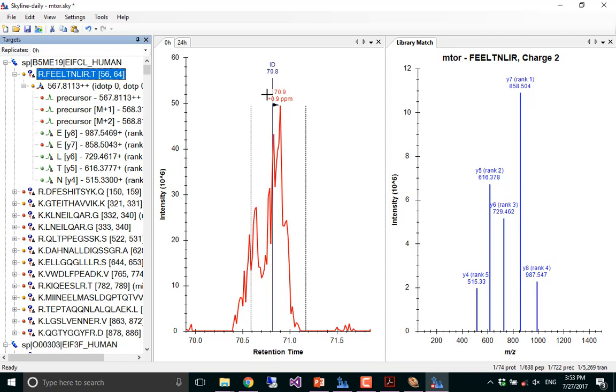And the reason why is because Pecan is a detection, but it's not going to show you the actual data. You want to be able to look at it at least a little bit. Even if you're not going to look at all the data, you at least want to make sure that Pecan is not screwing up. And that's better than having Skyline find it, because the algorithm is designed for looking for DIA data.